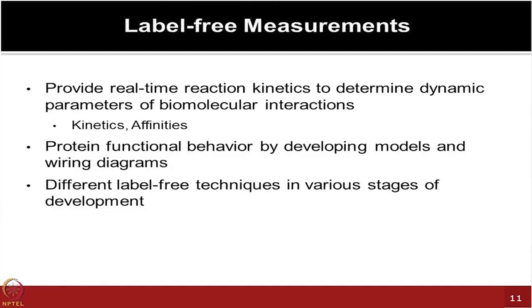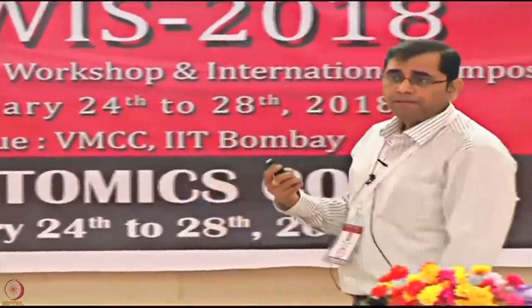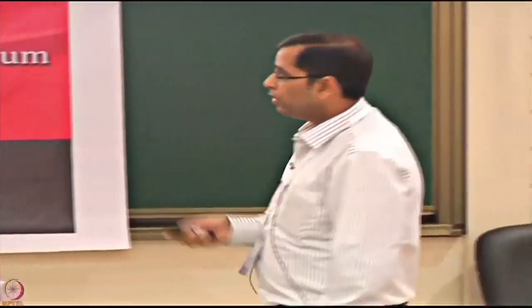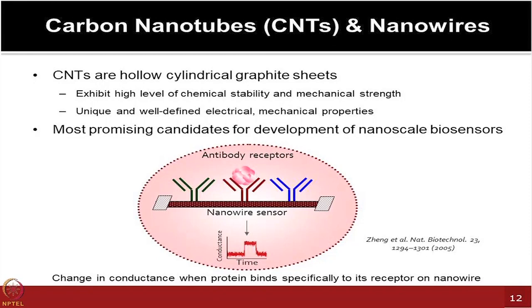So different types of label-free techniques, as I mentioned, are in various developmental phases. Of course, Biacore is pretty leading in that way, because you already have over 20 plus years of the technology in the field. But many technologies are still emerging, including some of the biolayer interferometry-based methods, which have come up really fast. Even MST technologies are emerging. So those could be good platforms to be used. I'm just showing you very briefly some of the principles involved in various types of label-free technologies.